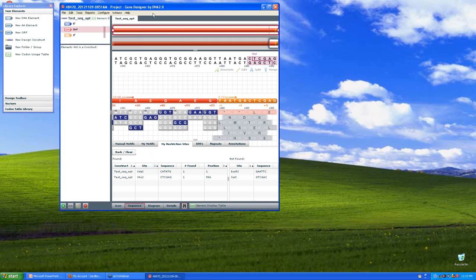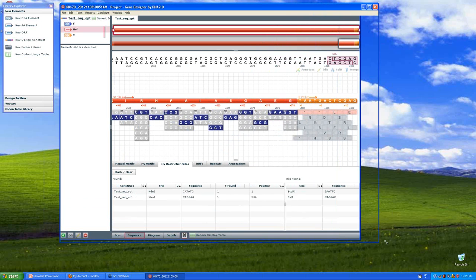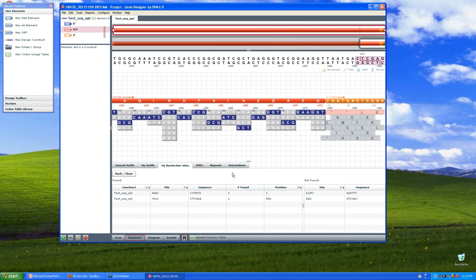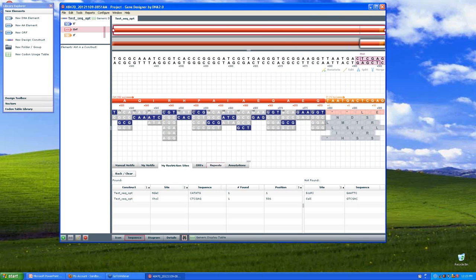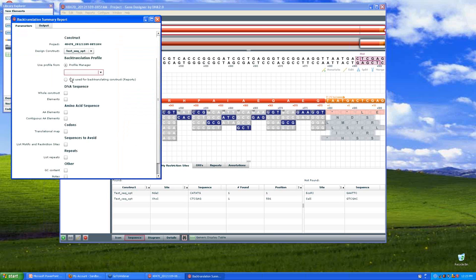So now that I've found that the amino acid sequence matches and my restriction sites have been respected, the next step would be to export the entire DNA sequence that DNA 2.0 is suggesting or proposing to make and compare that to the sequence that's in my account. So I would recommend going to Reports, Back Translation Summary Report, again.